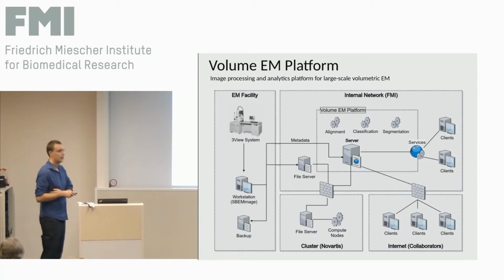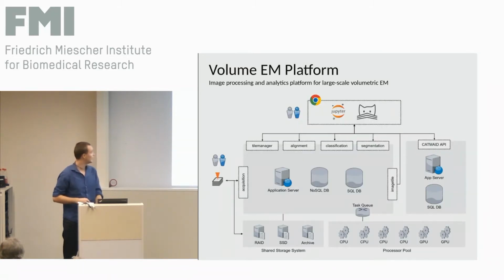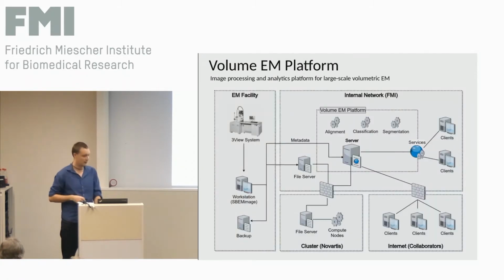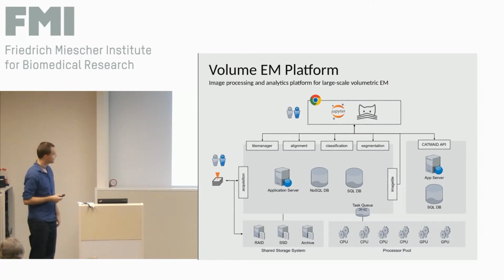And in case you need to do really a lot of computation, there is a way to communicate with a high-performance computing infrastructure, like the cluster at Novartis. So to go a bit more into detail on what the platform actually is, I made this diagram to give a bit more of an inside view.